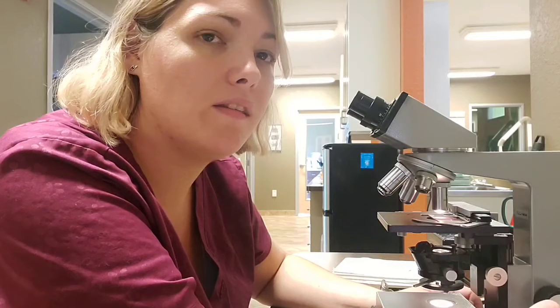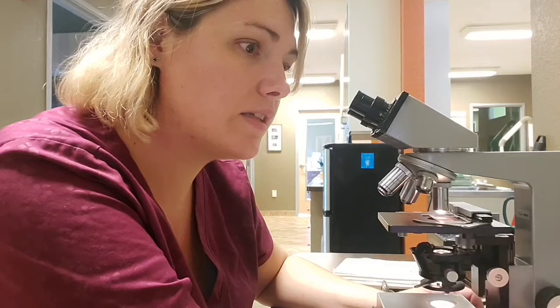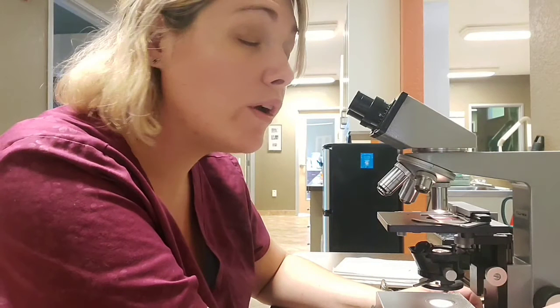It's not really something that we're usually too concerned about with dogs, but it is there, and typically we determine that based on the body size and the way that it's seen. Typically it's curved, as well as I believe it has a little bit more of a blunt head than the actual Dirofilaria immitis. So that's what we're taking a look at.